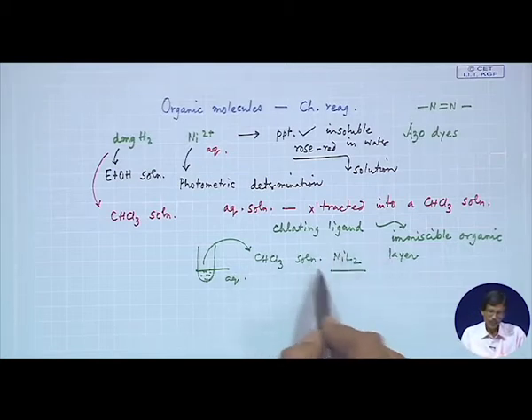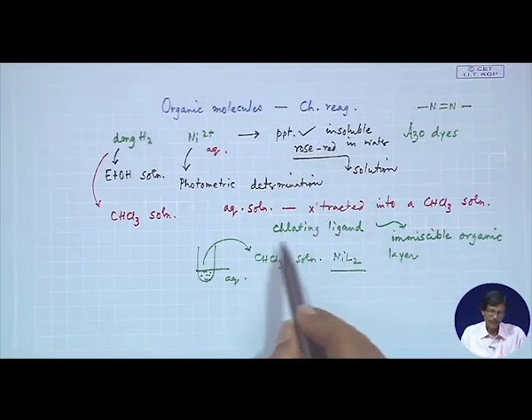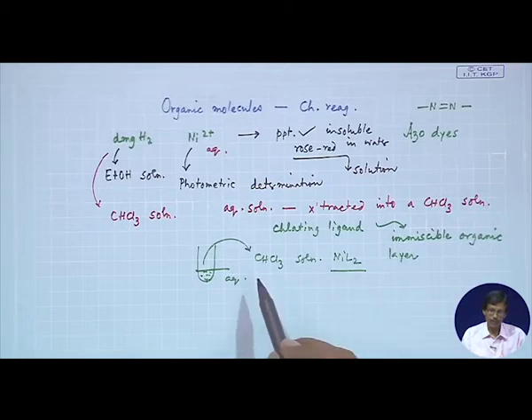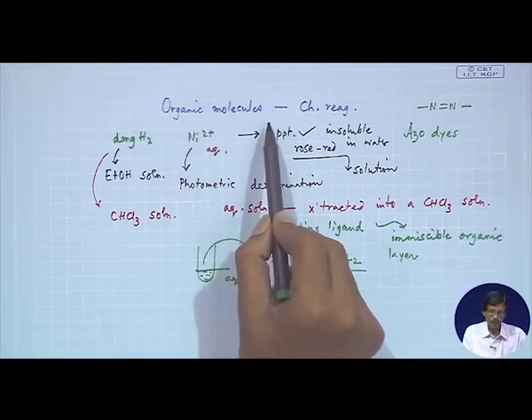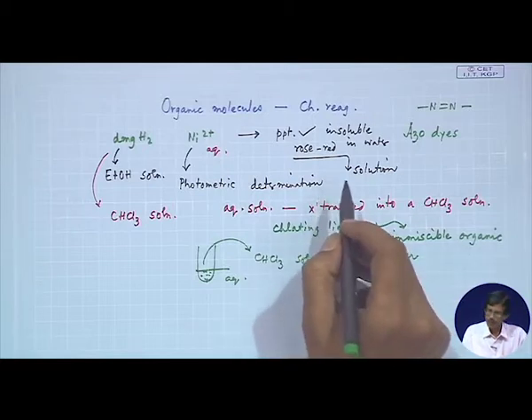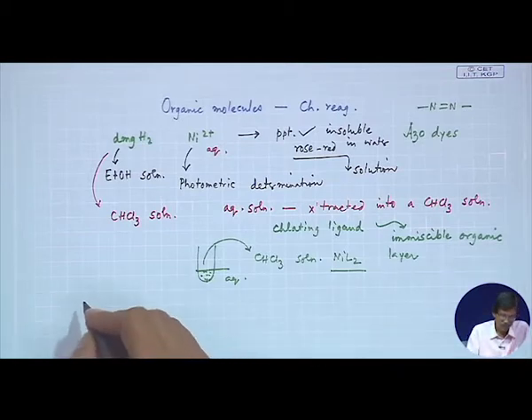So, the same rose red coloration can be there in this organic layer, and that organic layer we can put in the spectrophotometer to determine the unknown concentration of nickel in that particular species. So, what we do is use this organic molecule as a chromophoric reagent to develop some coloration. We will quickly see two more examples of those groups which can be very useful for our analysis.